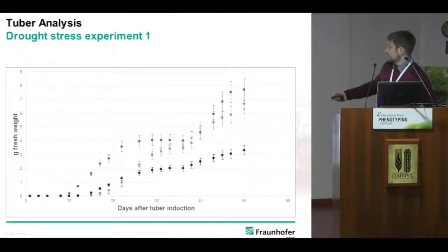And here it's just an example of the growth and transfer to grams in fresh weight for each individual tuber within a pot as a function of the days after the tuber induction of the first pot.